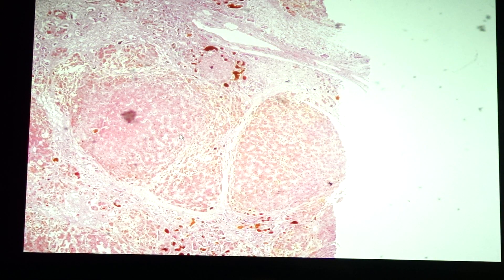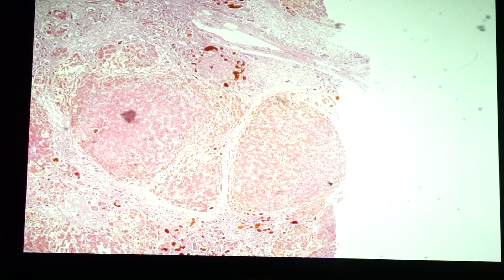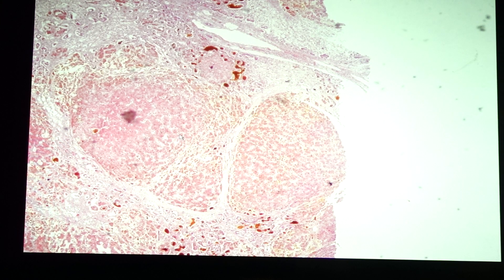Hello class, we are going to discuss today the slides for liver as well as one slide for the gallbladder: slide 183 liver cirrhosis, slide 130 gallbladder carcinoma, slide 124 hepatocellular carcinoma, and slide 169 hepatocellular carcinoma.